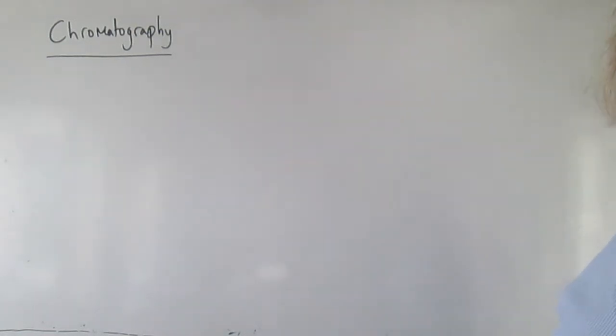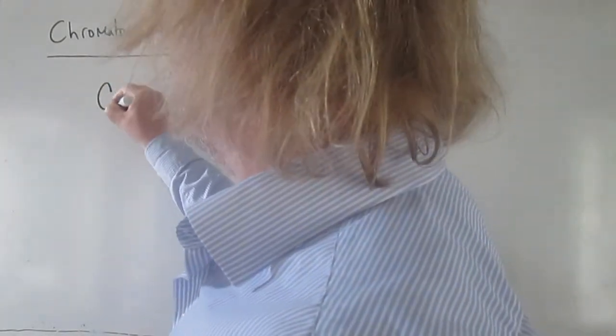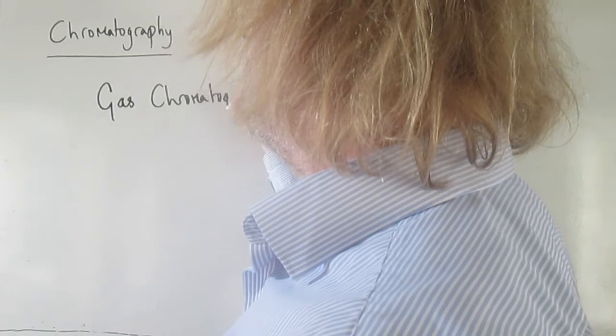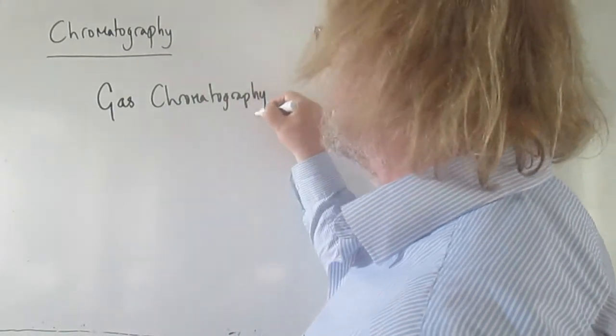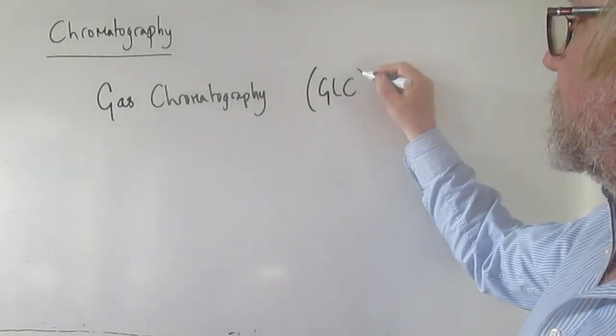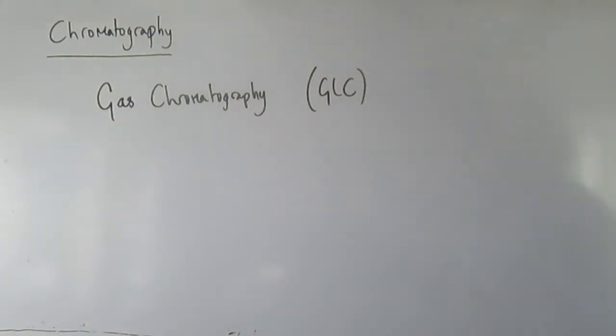The second type of chromatography that you need to know about is called gas chromatography, or sometimes gas liquid chromatography. And we'll see the significance of the liquid in a minute. So GLC, gas liquid chromatography.